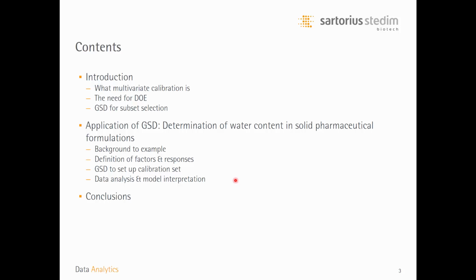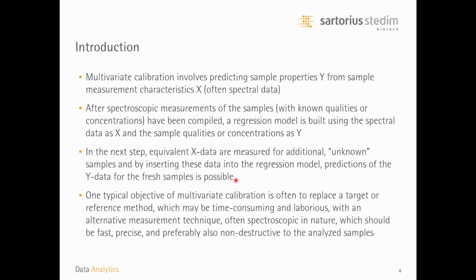Part of this webinar is a demonstration of the GSD functionality inside the MODDE software, and when we are doing that demonstration, we're going to assume some basic level of familiarity with the MODDE software solution. Towards the end, there will also be some concluding remarks.